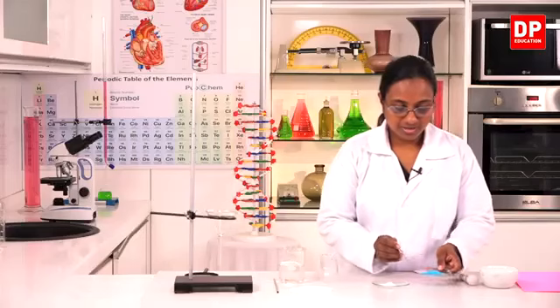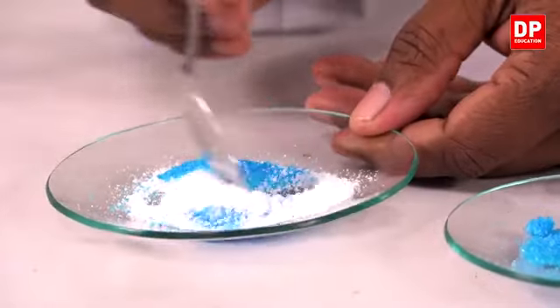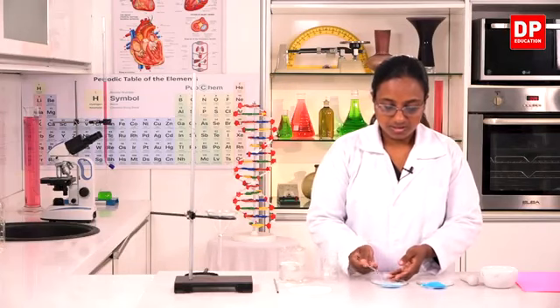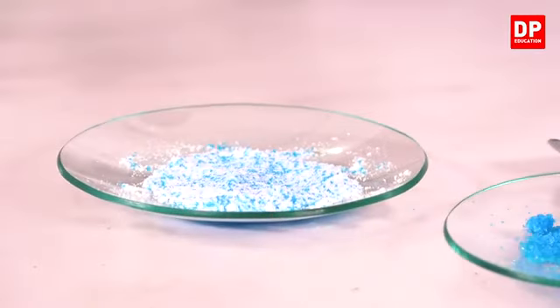Okay, to this I will add copper sulfate. Now I'll mix them both together. Now the two substances are mixed together completely.